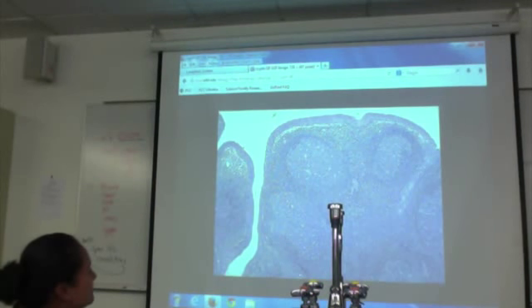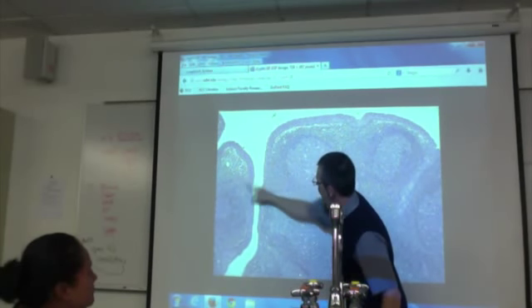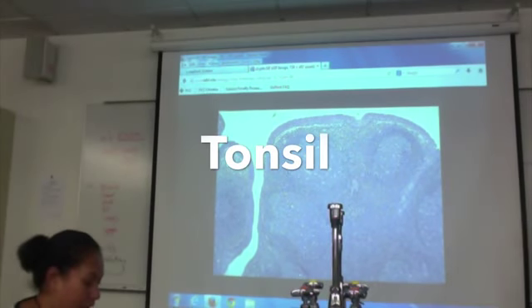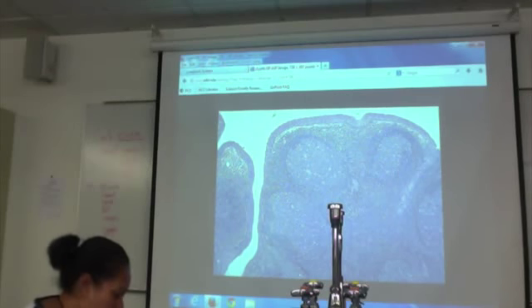That's hard. Well, you can see it right here because that's the same as that. Oh. Okay. Jonathan.